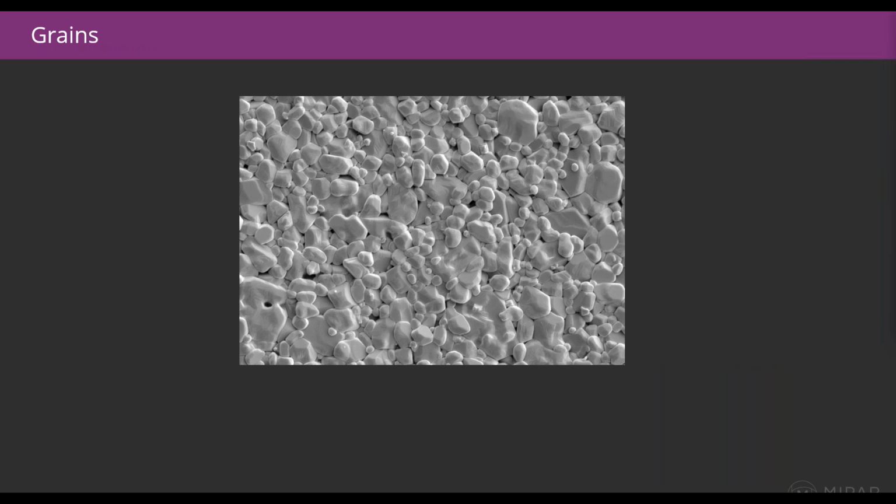We'll go back through the execution of the Spotlight step on this one example. As I mentioned, Spotlight is based on a transformer network similar to ChatGPT and other large language models, and is thus prompt-based. So effectively, when you hand Spotlight an image, the first thing it does is basically recognize every conceivable feature that it might possibly need to segment in the image.